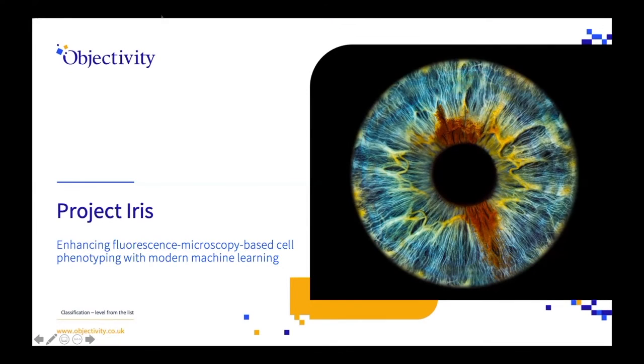So I will be talking today about Project Iris, which is designed to enhance the process of cell phenotyping from fluorescence microscopy images. So if you can move on to the next slide.